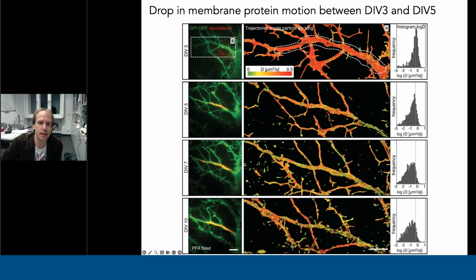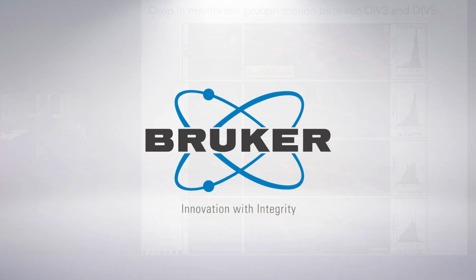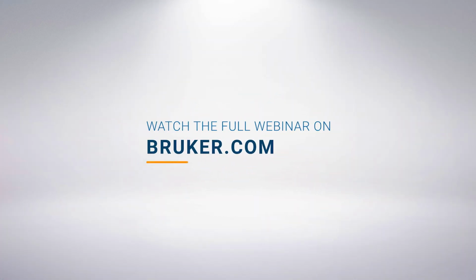Now at DIV 3, the cytoskeleton starts to assemble. We see neurofascin, and here it's more yellowish. Then as the days progress in the very same cell, we have more and more green trajectories, and our histogram here moves to the left. We can also look at the cumulative diffusion coefficient, and you can see that here where the actin ring is first assembled.